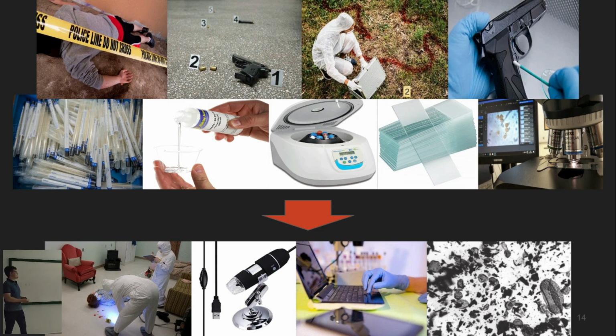And in my idea, that's why this is an innovative idea, because at a crime scene, a portable microscope, a computer or a cell phone could analyze the pollen grains directly at the crime scene without these laboratorial steps.